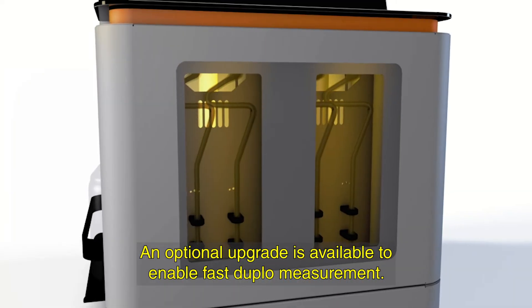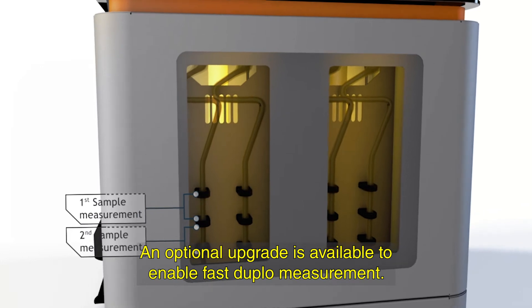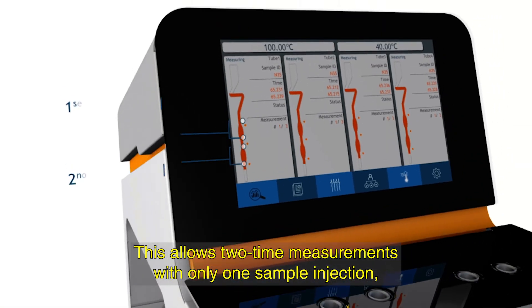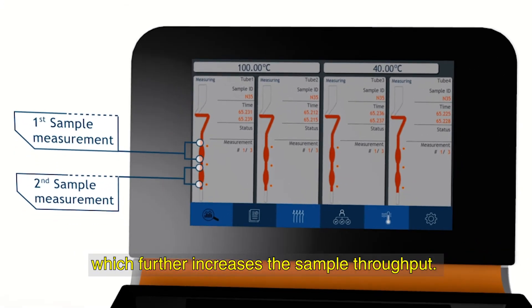An optional upgrade is available to enable fast Duplo measurement. This allows two time measurements with only one sample injection, which further increases the sample throughput.